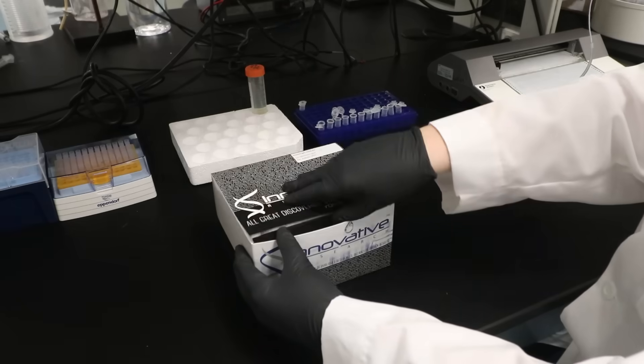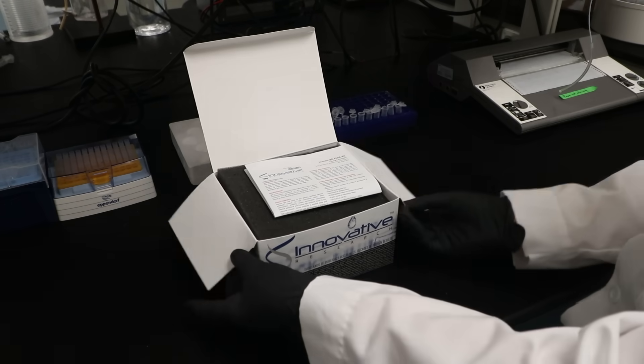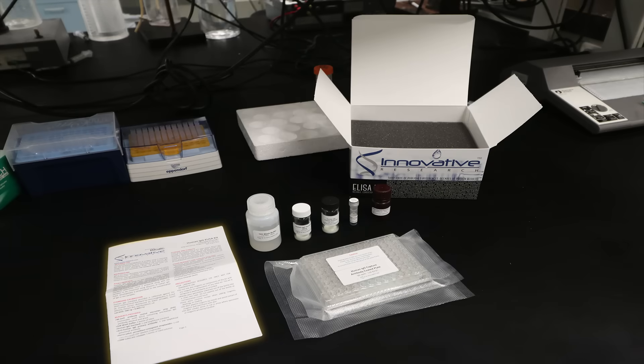Let's get started. First, let's review what's inside the kit: the kit instructions, product certificate of analysis, 96-well antibody-coated microtiter strip plate, a 10x wash buffer, human IgG standard, anti-human IgG primary antibody, horseradish peroxidase conjugated streptavidin, and TMB substrate solution.